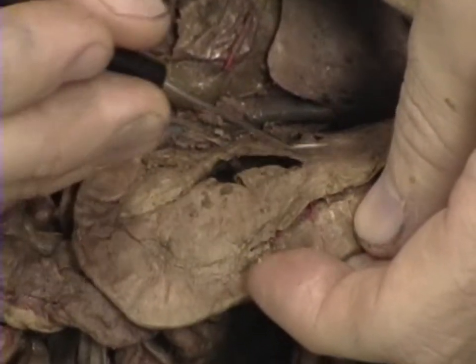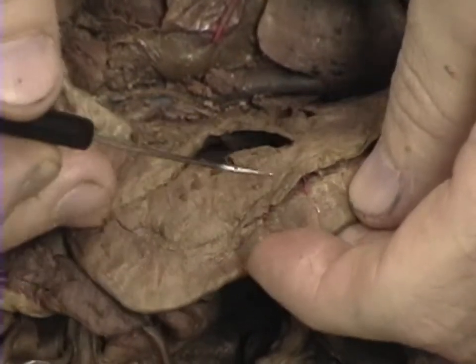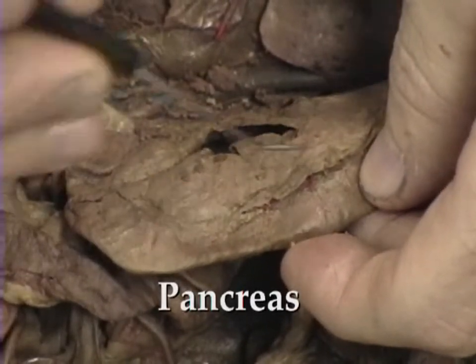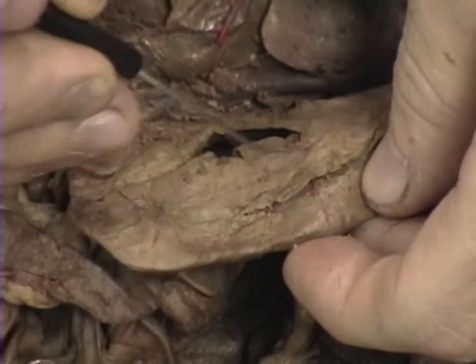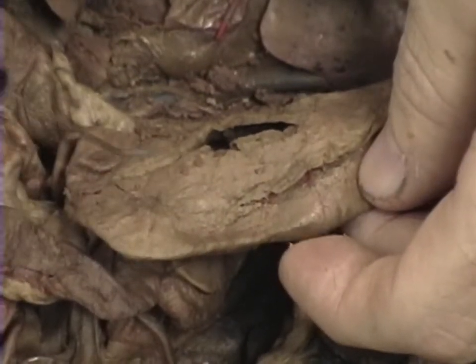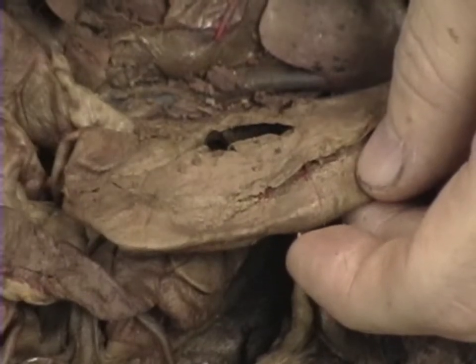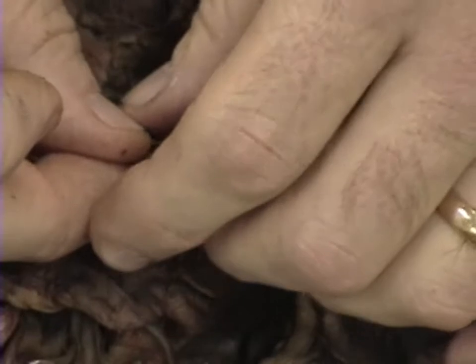And it's difficult to find oftentimes because the tissue isn't quite different, but yet it is. This portion right here is the pancreas. And within the C-shaped portion of the duodenum is a tissue here called the pancreas, which produces insulin, as well as other digestive enzymes. This is only a portion of it. It runs all the way back and underneath the stomach. That's the duodenum, the first portion of the small intestine.